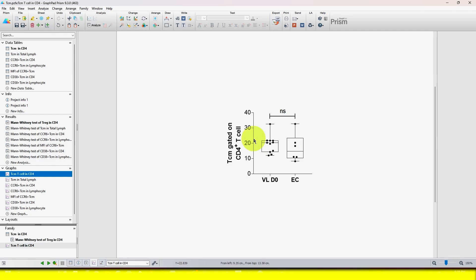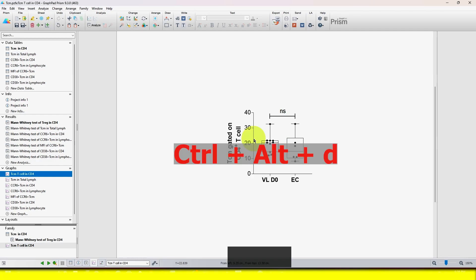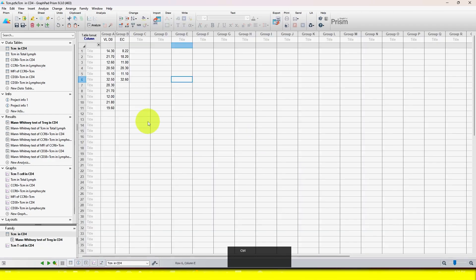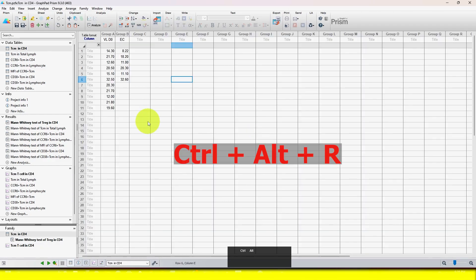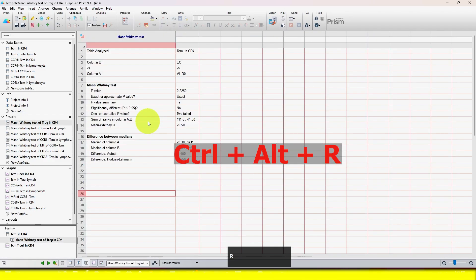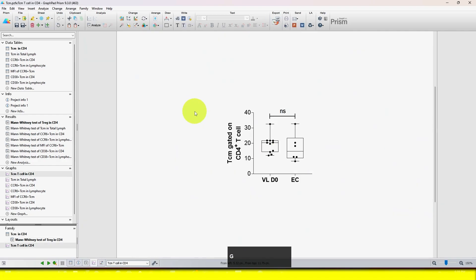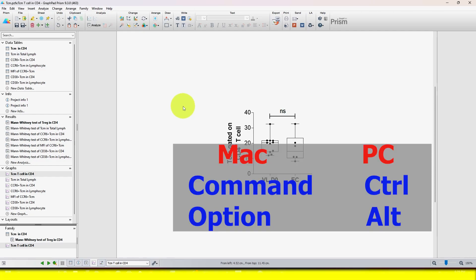Likewise, if you want to see the data table associated with a graph, just press Ctrl+Alt+D for the data table, Ctrl+Alt+R for the result, and Ctrl+Alt+G for the graph. This is very easy. Note that these shortcuts are for PC. For Mac, use Command in place of Ctrl and Option in place of Alt.